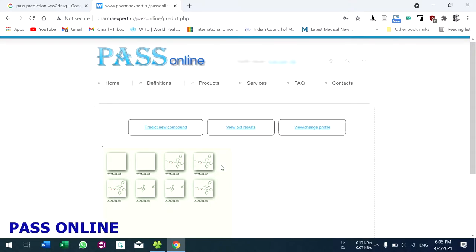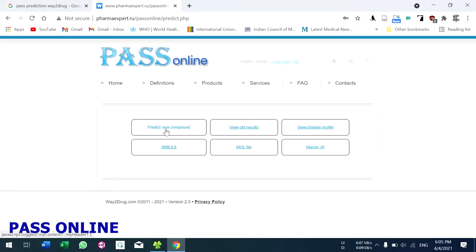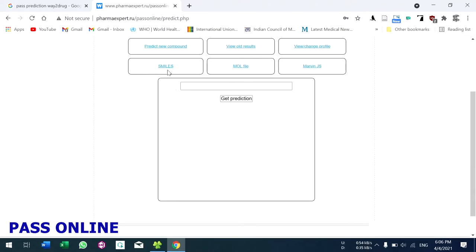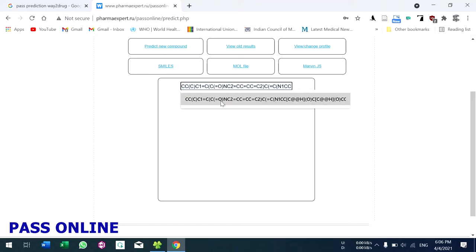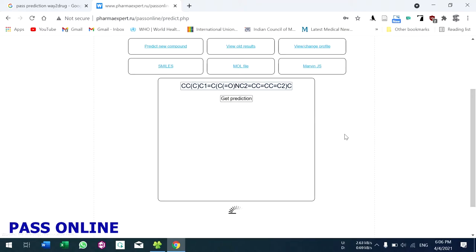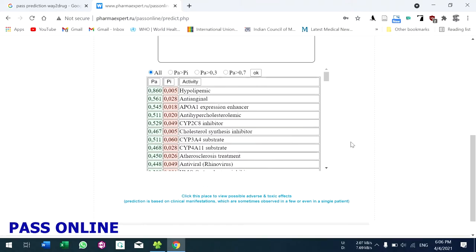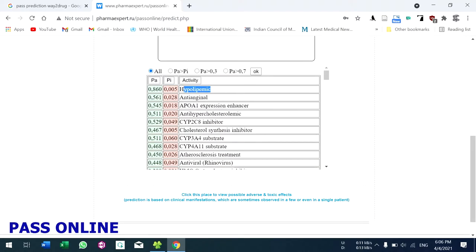To view old results, click here and check the results. To predict a new compound, click this one. You have three options: enter the SMILES format, or upload your file in MOL format. After clicking SMILES, enter your SMILES notation and click 'Get Prediction'. After loading, you will get your results. This compound is hypolipidemic, anti-angina, and has many other biological activities.